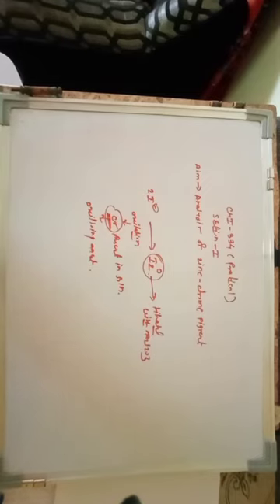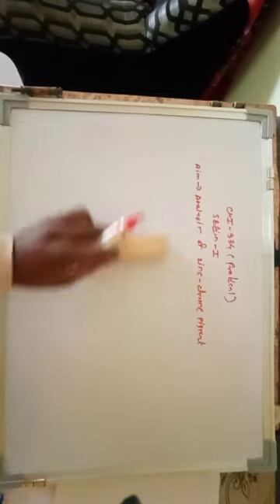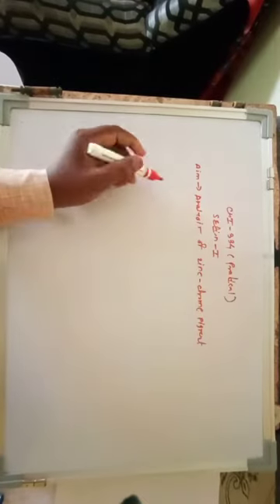Again, we already discussed the procedure. So this is a very simple iodometric determination of chromium, in which the liberated iodine is titrated with Na2S2O3 using starch as an indicator. So let us discuss the second component, that is zinc. Determination of zinc.